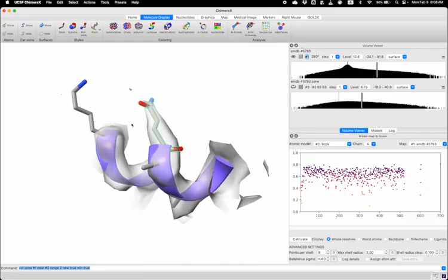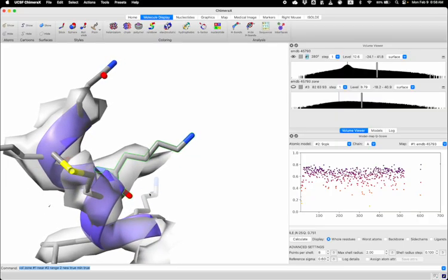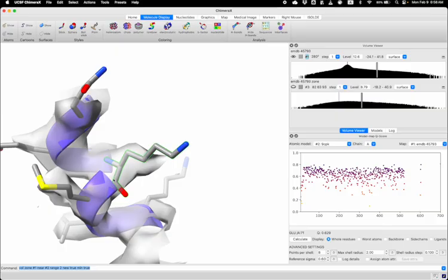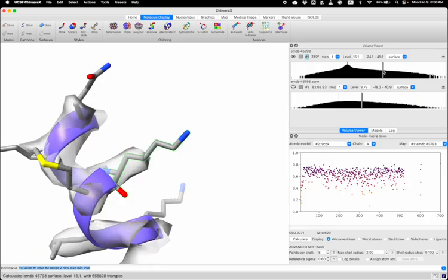And some residues might not be resolved, as we talked about before, so this is a long residue which is usually flexible. If I click on a point with a low score, these are residues that tend to be not resolved, like this one. So this one, the backbone is resolved, but as you go further away, the density becomes weak, and we consider these as partially resolved or less resolved.